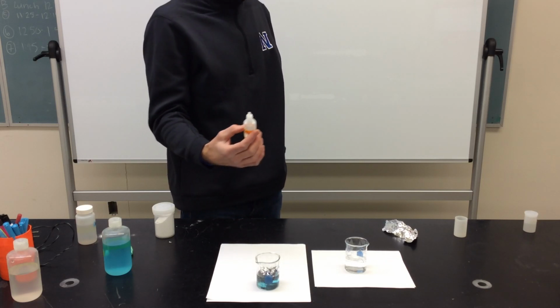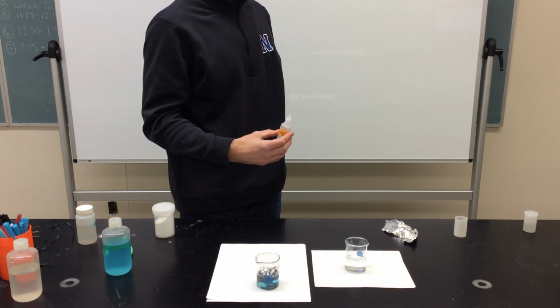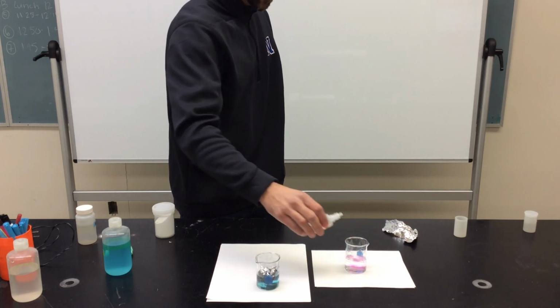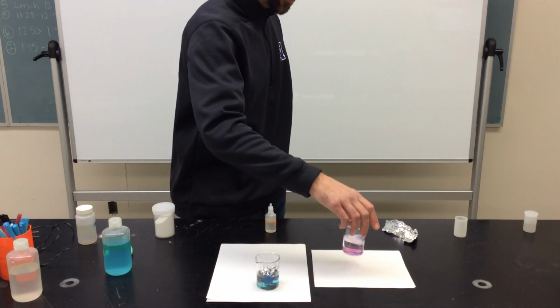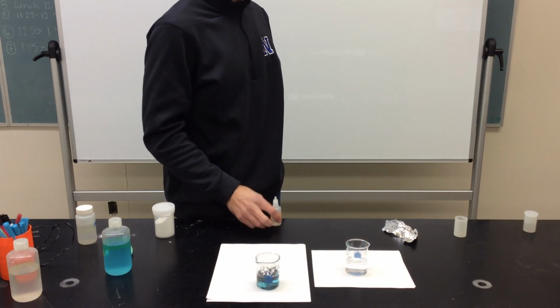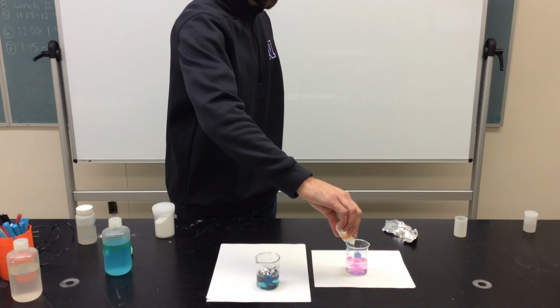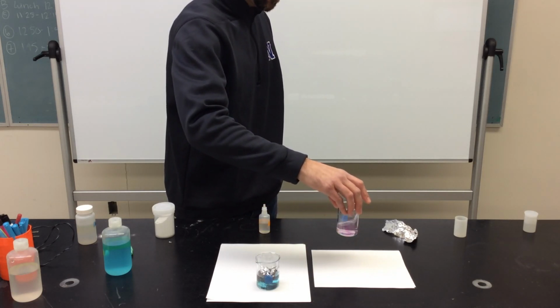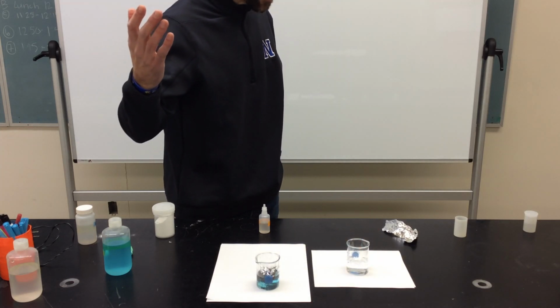So let's try it again. What do you think will happen if I add a second little squirt here? Purple. Okay, we'll see. So I add a little squirt. We get that nice pink purple color. Magic swirl. Voila, goes away. If we do it a third time, now our purple's staying in there a little bit. Oh, now it's gone. Comes and goes, comes and goes.